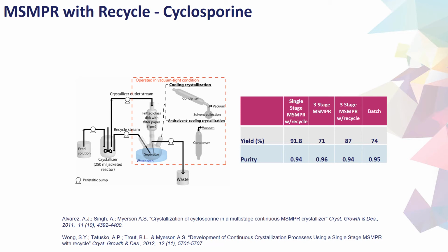In the case of some crystallization systems, if higher supersaturations and lower batch or residence times are used, as in the case of continuous. As we've seen in continuous operation, we will use, or at least try to use, relatively low residence times in comparison to batch crystallizations, which have to be slow due to their need for a large amount of scale-up in batch operation due to lack of productivity in that mode of production.